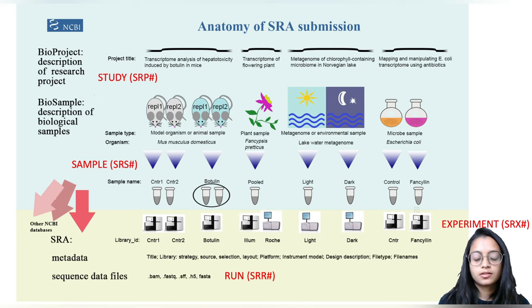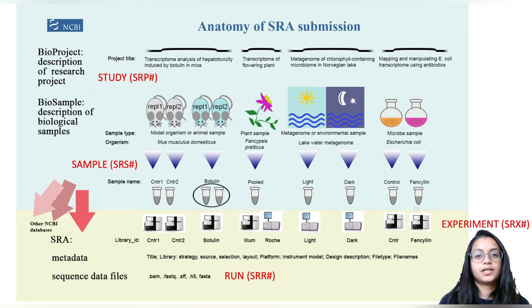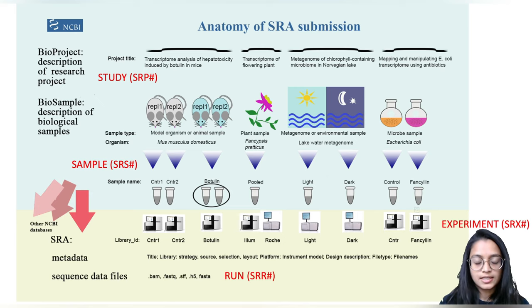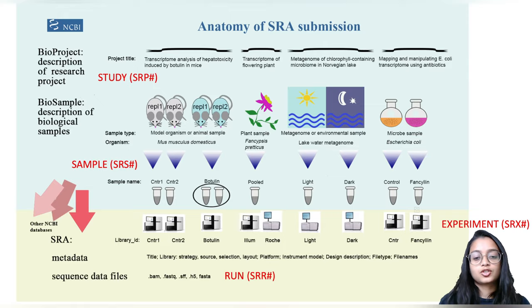We can also find information about the experiment, which details information about the sequencer and details about the library preparation. These records start with accession SRX. Lastly, we have runs, which start with accession SRR, and these are actually associated with the raw files or the sequencing files. Today we are going to be retrieving the sequencing data using the SRR IDs, and I'll demonstrate how to find the SRR IDs associated with the samples we're interested in.